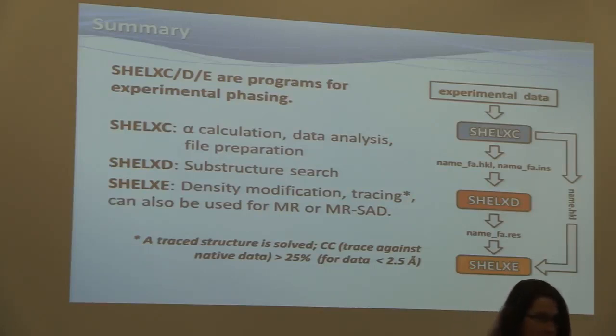The triplet equations rely on your strong anomalous differences. So if you have outliers in that kind of regime, I guess that has quite a big impact. Do you have any recommendations for trimming outliers prior to this? Absolutely. Use a good mask in integration. This is really crucial. You need to block the beam stop and everything in its vicinity.